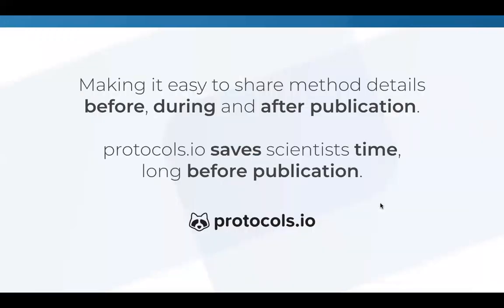But as I mentioned in the beginning, our mission is to make it easy to share method details before, during, and after publication. But I also really want to mention here that protocols.io can save scientists time even long before publication. So if you're using protocols.io before you're ready to publish, if you then are publishing, it's literally a click of a button. You can get a DOI for your methods, and it really can save you time while you're developing the method as well.